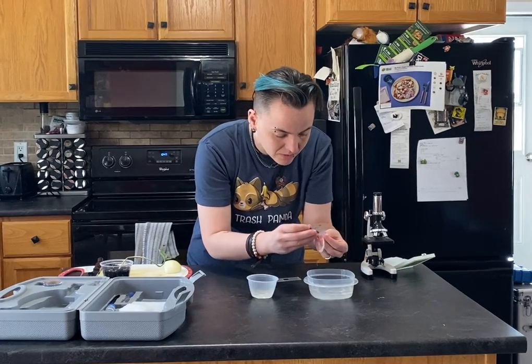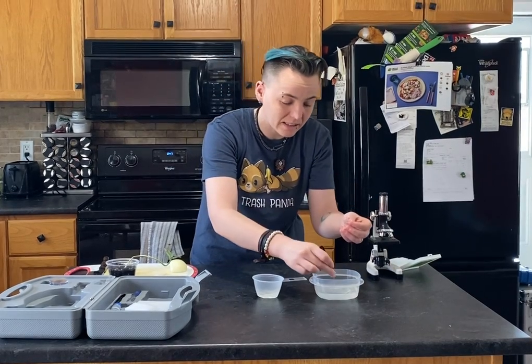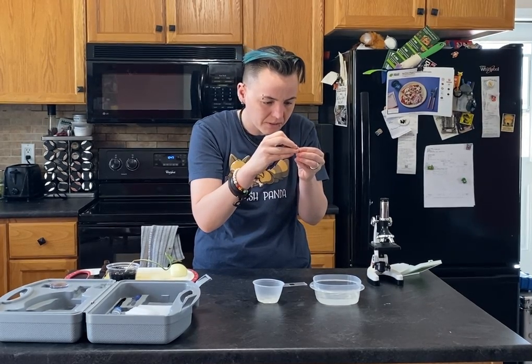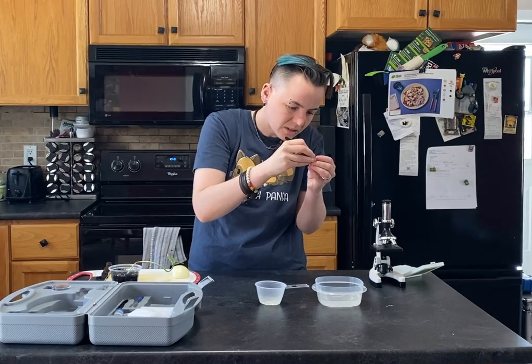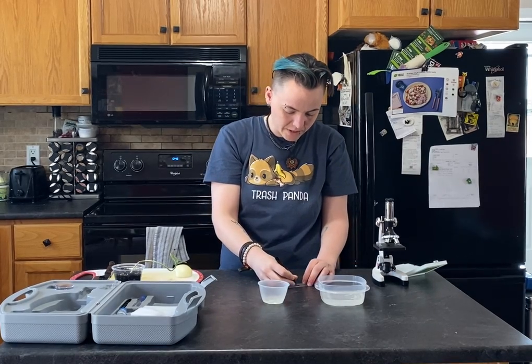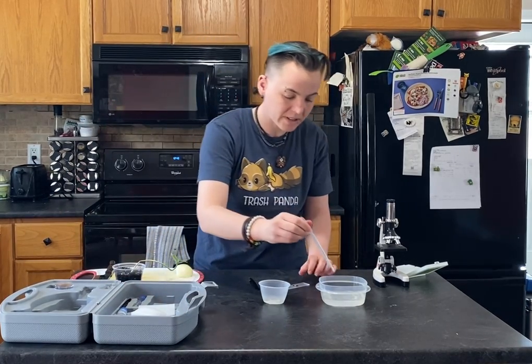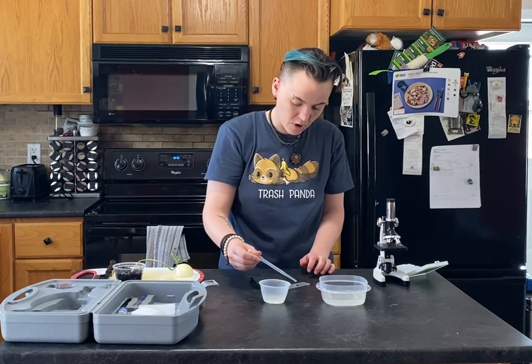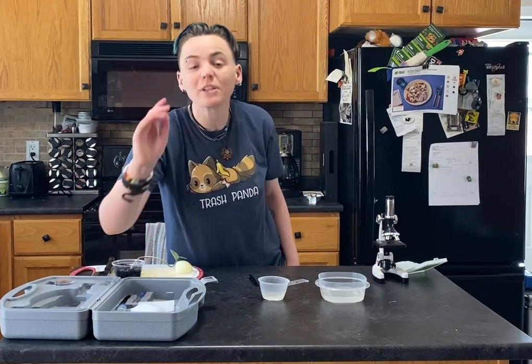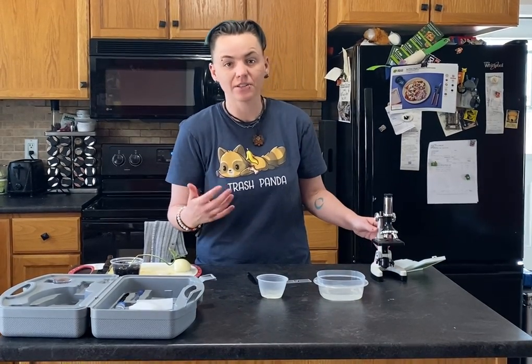We're just going to take our little slices of onion and remove that epidermal skin. It really is like skin that we have. We're going to take it from the underside and just peel it off. So there you go — we have our peeled onion skin. You're going to put it on your slide, then take your pipette and add a little bit of that salt water — just a drop on your slide. You should add a cover slip, because water can leak onto your microscope and cause it to rust and corrode.